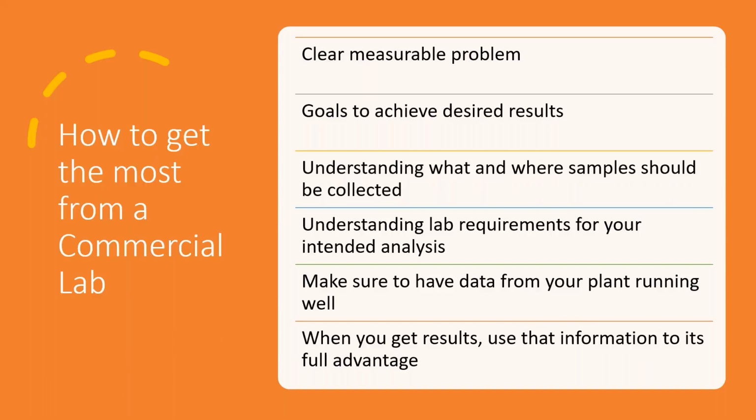One situation I worked with years ago, an operator was taking a sample to the lab, and they had a lab on site. He was picking up the sample on the far end of the plant and walking to the lab with an open pail of the sample, sloshing the water out as he walked. What he was sloshing out was the clear water from the solids settling. So when the lab ran the test, it always showed that they had too high a level of solids in their aeration tank, because the operator concentrated it before he got to the lab. They kept wasting their activated sludge, until all of a sudden they almost totally wiped out all their solids before they figured out what was going on. So they had to solve that sampling problem. And the people in the lab had no way of knowing that was going on.